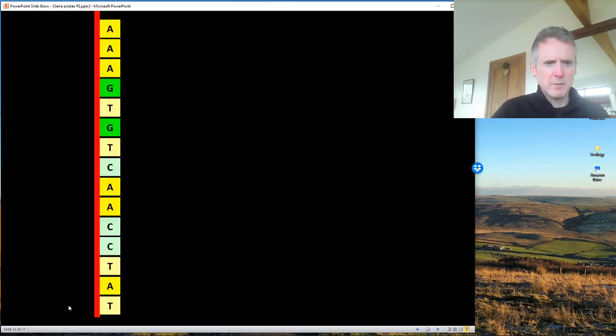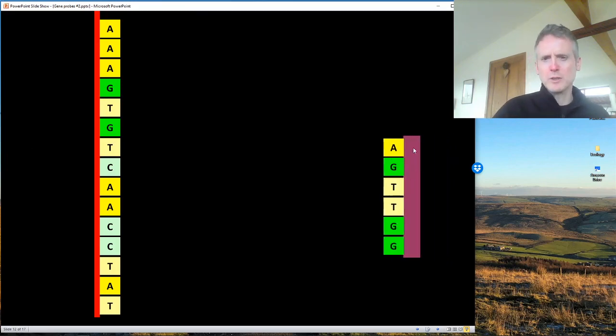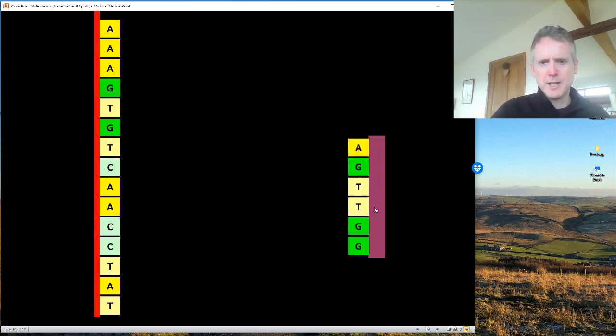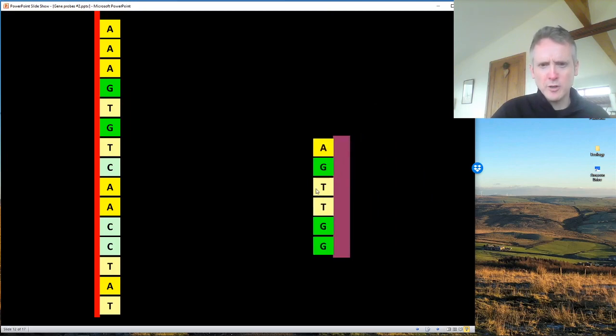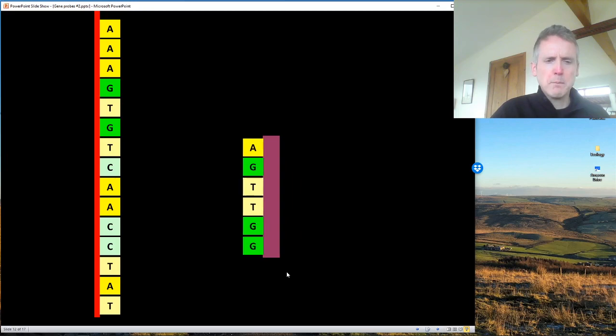And this is my way of showing how the probe attaches. So this is the normal DNA. So this is the normal sugar phosphate backbone, and this is the code. So in this area here would be the nylon. So the code is sticking off, and in comes a gene probe. Okay, it's got a different coloured backbone. It's purple to show that it's made of radioactive phosphorus, not normal phosphorus, and its sequence is complementary.